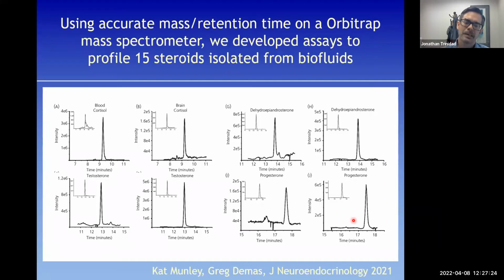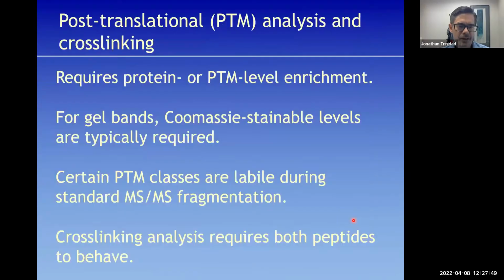And so even though many small molecules might have similar-ish masses, since you're also measuring the mass of resulting fragment ions, the odds that two compounds have both a similar precursor mass and also generate similar massed fragment ions is pretty low. So this is sort of an ongoing series of projects.